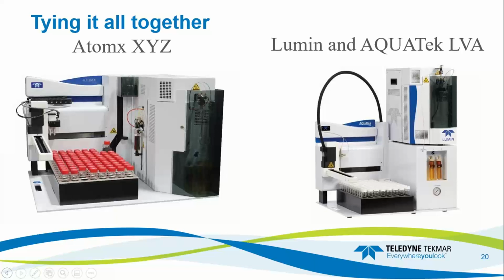Overall, Tekmar's improved moisture control fitting on the Atomx XYZ and the Lumin and application control, like choosing the correct trap for your target analytes, purging your sample at an optimized temperature, possibly adding in some dry purge if you need it, shortening your desorb time, and adding in adequate bake time to clean up and remove moisture from the system from sample to sample, are all the things that you can do to improve the moisture control and sample throughput of your VOC analysis.